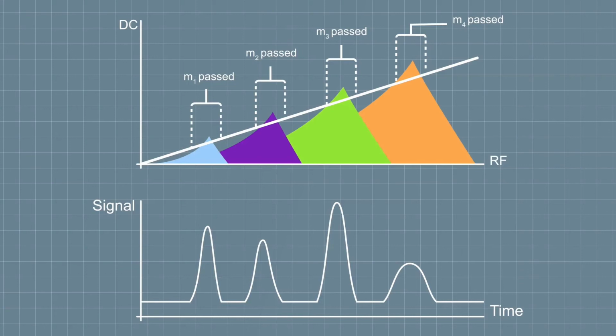Okay, good job hanging in there for a bunch of physics and voltages. I promise it is important that you have some understanding of the quadrupole. It is by far the most common mass analyzer in the world, and it's very common for you to be asked about this when people are assessing your instrumental skills in an interview.